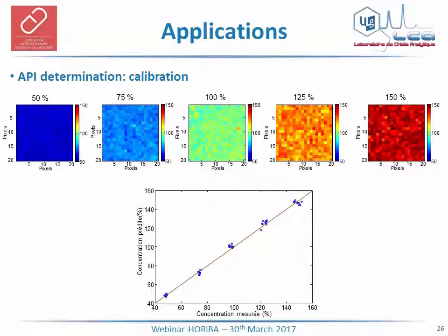As Raman spectroscopy, Raman hyperspectral imaging can be used in quantitative applications in which a global or single determination could be an issue. A typical example is scored tablets. Each half of the scored tablet has to contain the same amount of API.